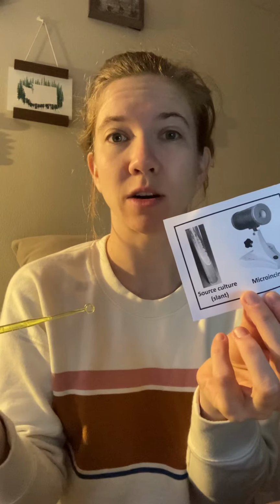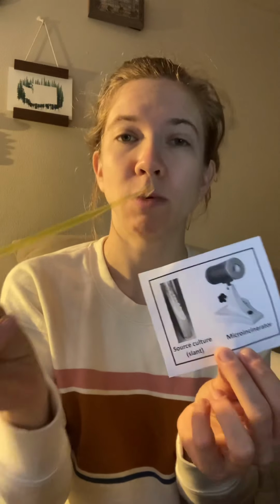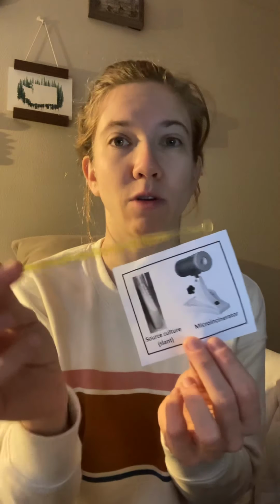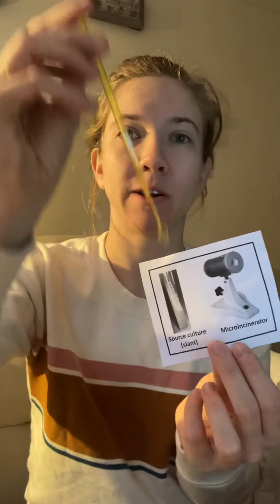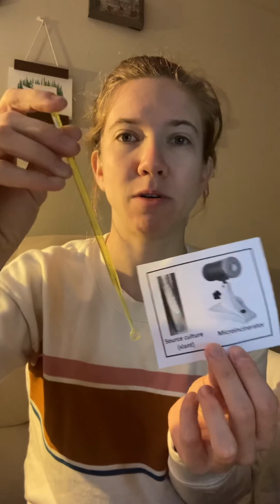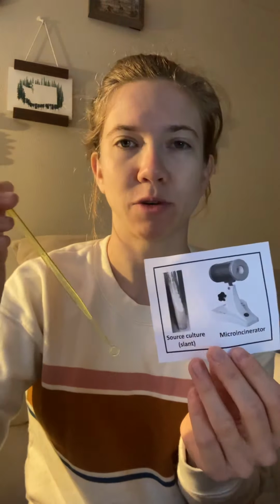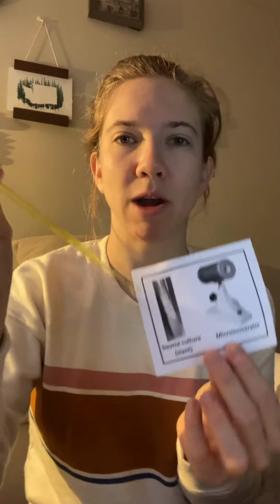Then we're going to open our source culture, remembering to use that pinky finger so that your loop stays sterile. Once you open that culture tube, hold the lip of it close to, not against, the micro incinerator opening to kill off any bacteria. You only need to hold it there for 2 to 3 seconds. Then you can put your inoculating loop into the source culture and get a good sample. You'll have swished it around, of course, before you opened it so that everything's mixed and not just separated out.